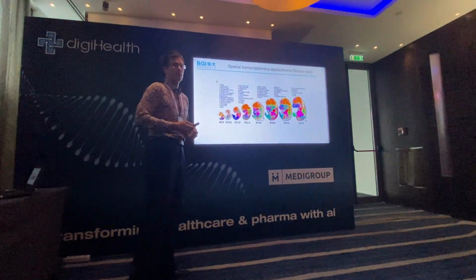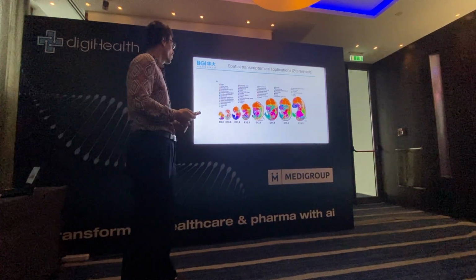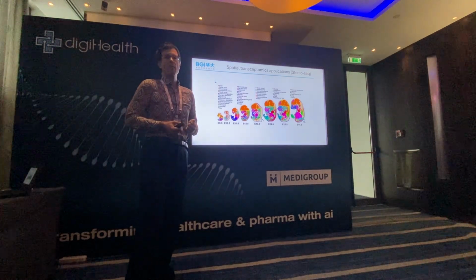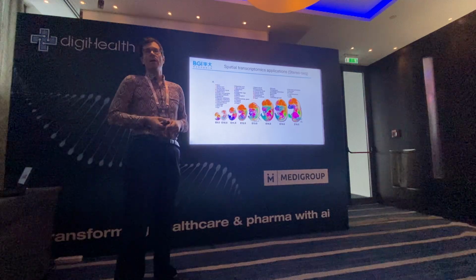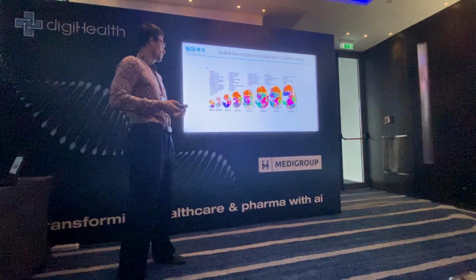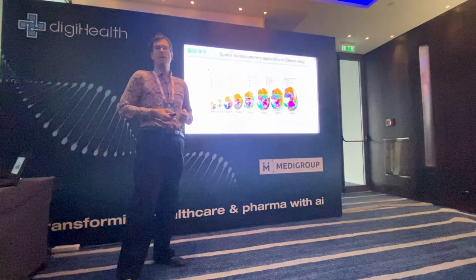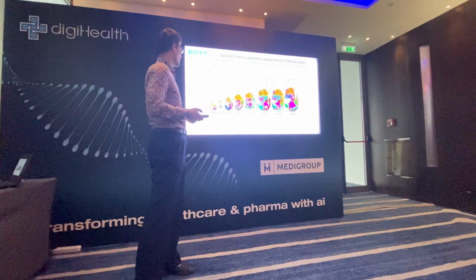So with that, what can be done? This is just one of the examples. You can study many different organisms. Currently, the technology is mostly used in fundamental science, in obtaining knowledge and information about the function of the cells inside of the tissue, how the cells are communicating, how the microenvironment in the cell is functioning.